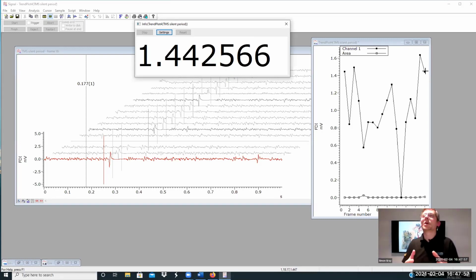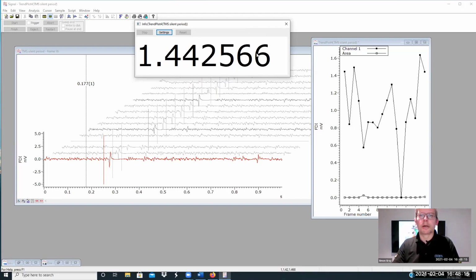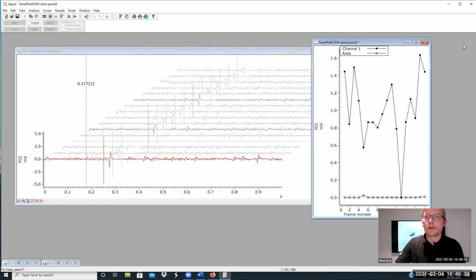So if you can imagine that we're sampling data or stepping through sweeps, adding measurements as we go in a more manual form, I'll show you that as well, then this could be showing you, and in fact, it could also speak the value as and when there is a change. Okay, so I hope that answers your question there. Value calculated by code to print into info window instead of log. Yeah, I think I'm getting there. All right.